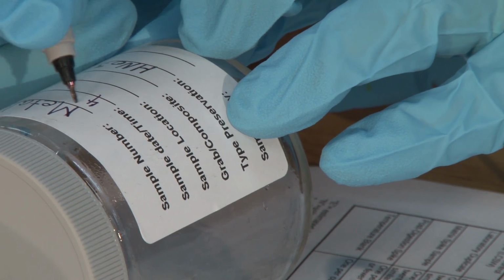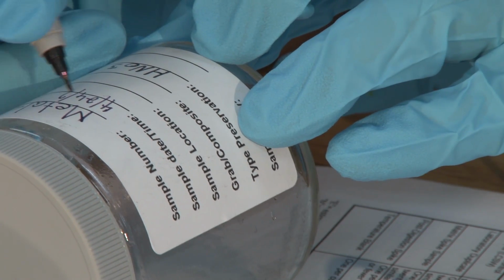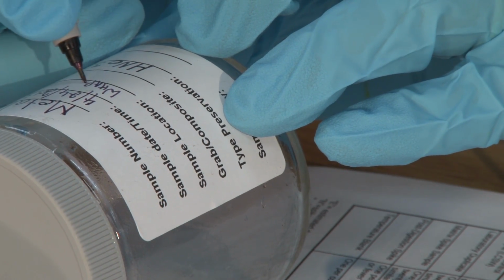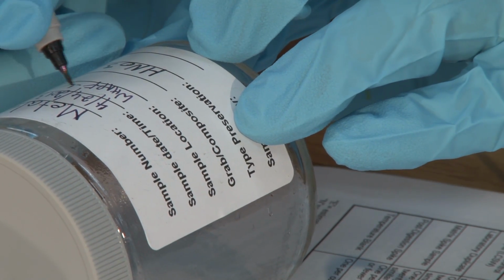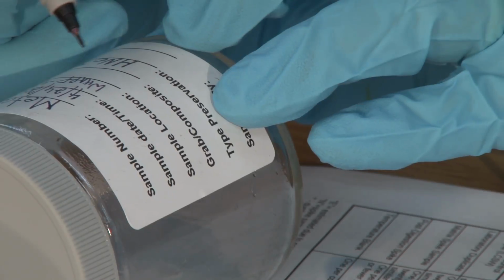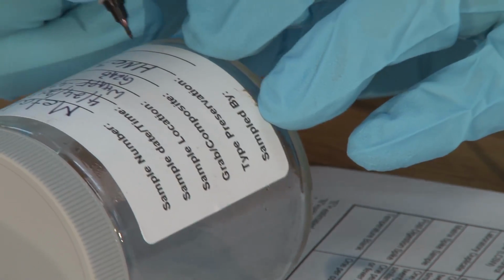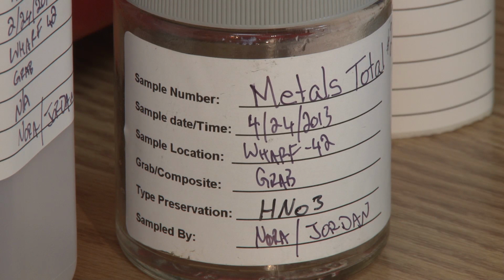Label each sample container. This is very important. A labeling mistake or a missing or unreadable label can wipe out all of the effort put into sample collection. To save time, partially complete labels before beginning the sampling activity. Keep labels clean and dry. Sample label information includes the facility name and the sample number.